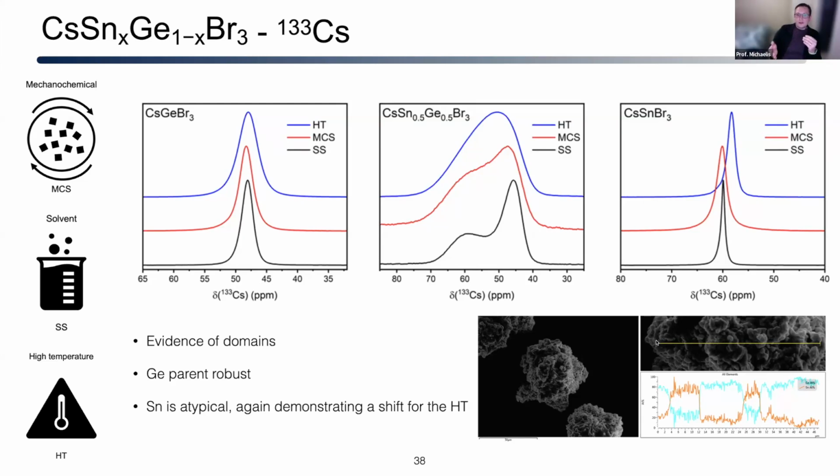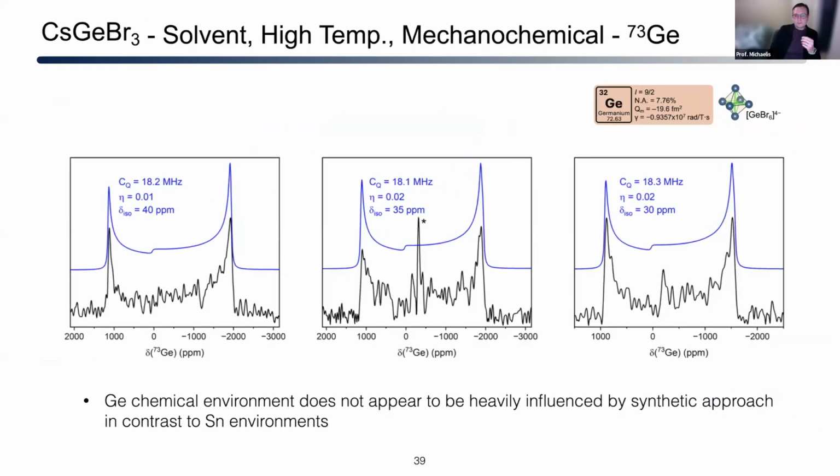So although there is always tin-germanium mixing, the overall phase space, if you will, as the crystal grows, is that you go into a germanium-rich regime, and then you form a tin-rich regime, and it just oscillates back and forth depending on the composition and what ions are around it.